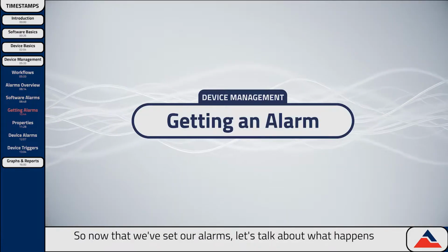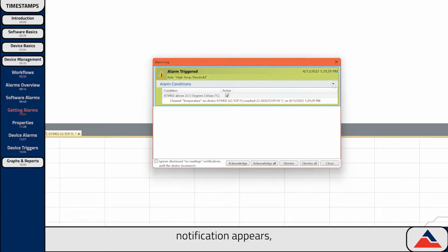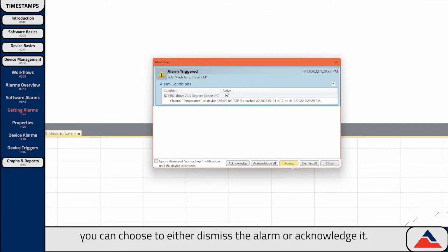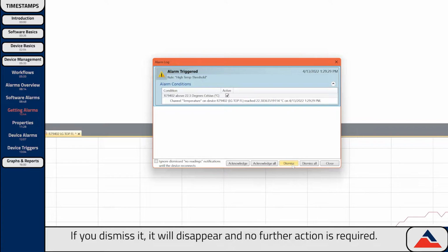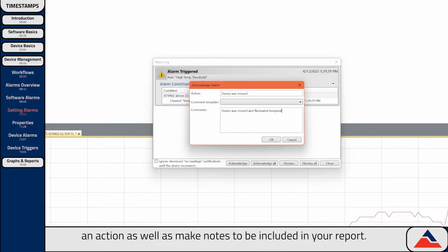So now that we've set our alarms, let's talk about what happens when you get one. Whenever an alarm notification appears, you can choose to either dismiss the alarm or acknowledge it. If you dismiss it, it will disappear and no further action is required. If you acknowledge the alarm, you'll have the opportunity to specify an action as well as make notes to be included in your report.